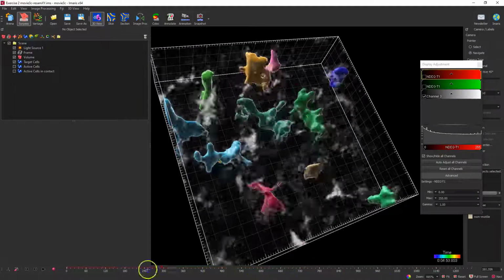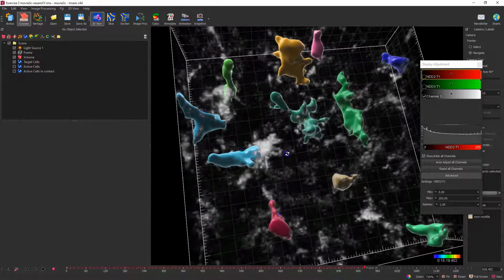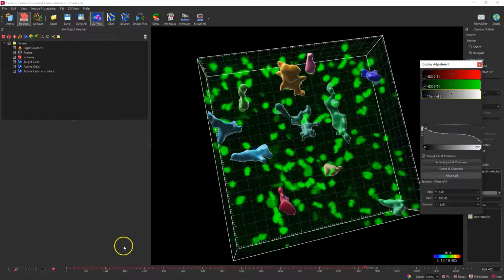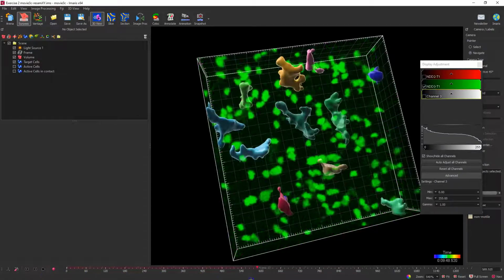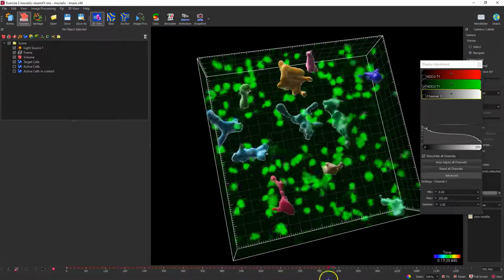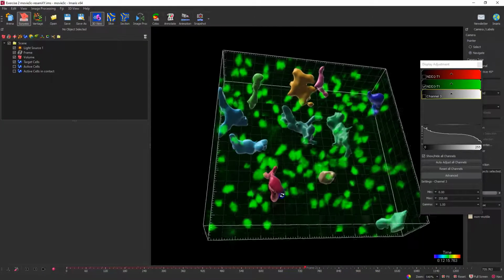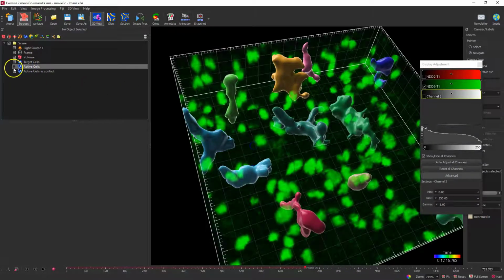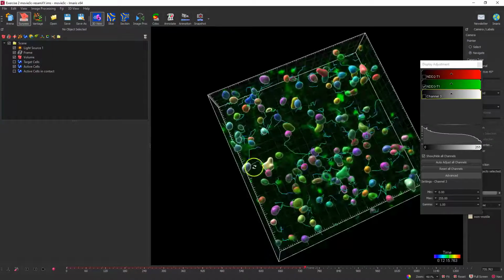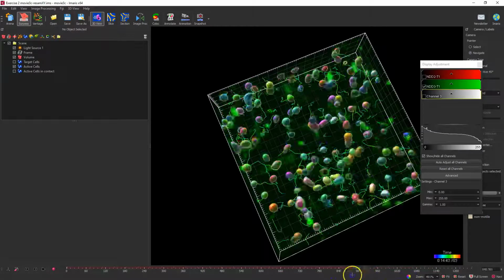So yeah, so I detected these target cells, and for a data set like this, a question that we often get is, I just want to track the green ones that are coming in contact with these target cells. I want to know how much time they're spending in contact, things like that. And what's really nice about Imaris 9.5 is that it's a lot easier to get that contact information out. So I went ahead and tracked all of these active cells, right? And we've got all of these cells going all over the place, and we can see those tracks.